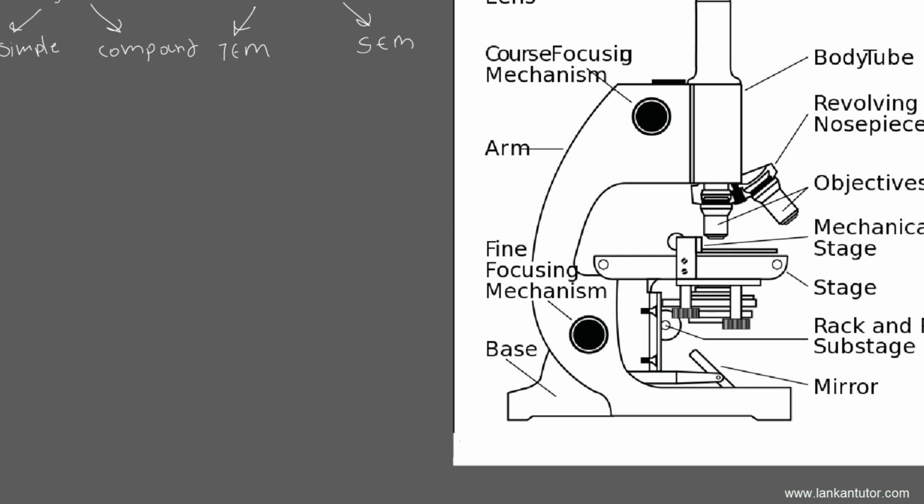You need to know how the microscope works. So we'll get into the light microscope extremely briefly, because you don't really need to know that much about the electron microscope in our syllabus. Now, the light microscope is just two lenses, but it has a very limited magnification. We're told that it has generally around 1,000 at max. It doesn't usually go above 1,000, even though you could make it do that. But the problem is, you can't get an extremely clear image. Theoretically, otherwise, you could just simply put 40 into 40 into 40 and keep going and get a stronger image than that of an electron microscope. So you can see the structure of a light microscope. There is the eyepiece lens and an objective lens. The objective lens usually has a higher power than the eyepiece, and it can be switched between lenses.